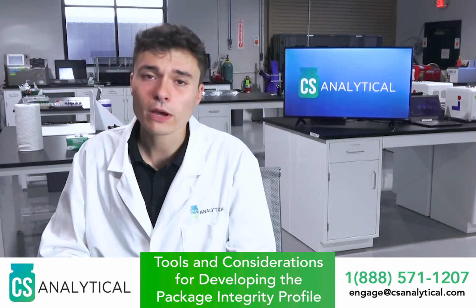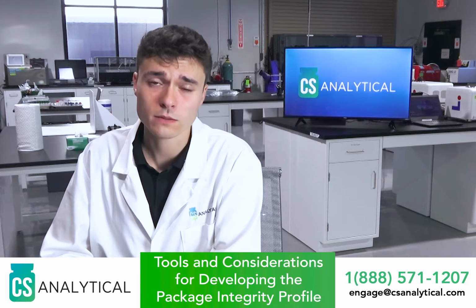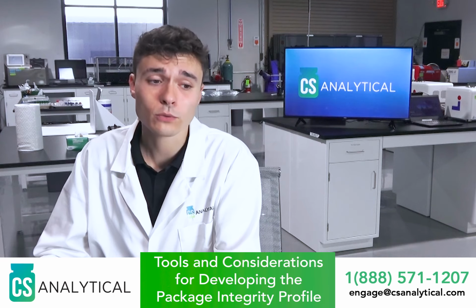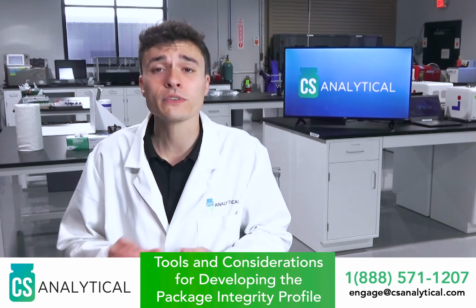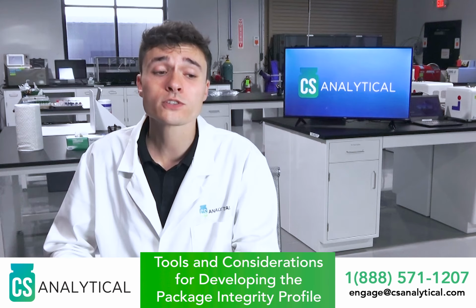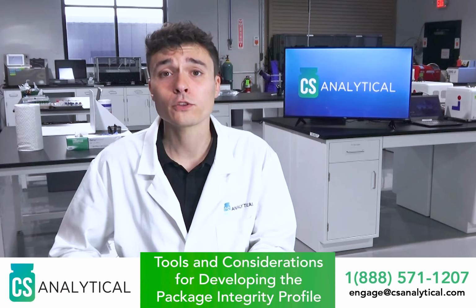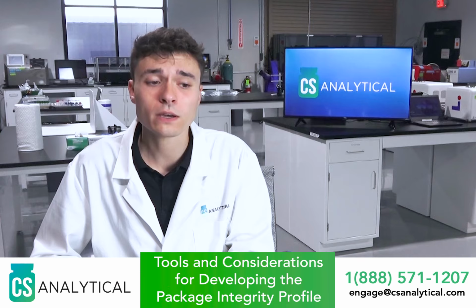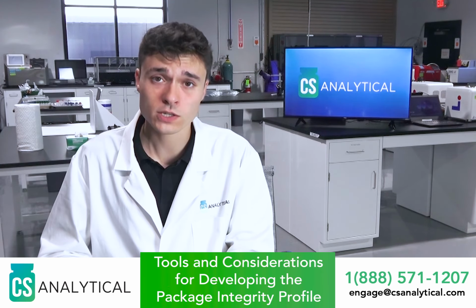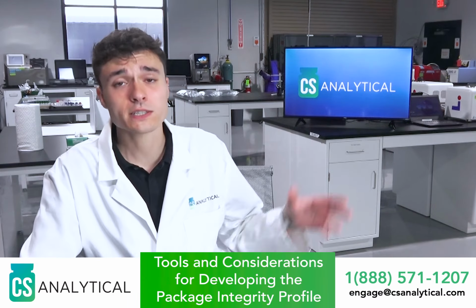And so when we think about all these different variables, sure, there are certainly different package systems that can be more challenging than others. An example of that would be an auto-injection system, so let's say a pre-filled syringe or cartridge inside of that delivery device. Then also large flexible packaging like IV bags. Again, the reason that these are challenging is because of that final package presentation, the limitations that the package system imposes, and that the product imposes, relative to the capabilities of these instruments.